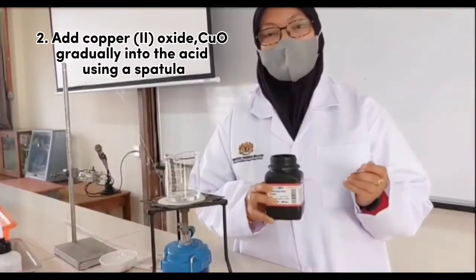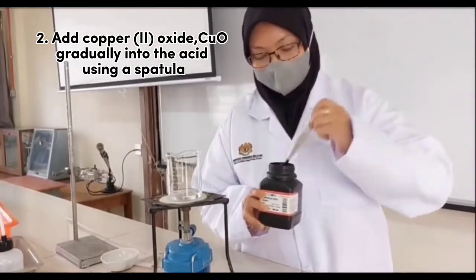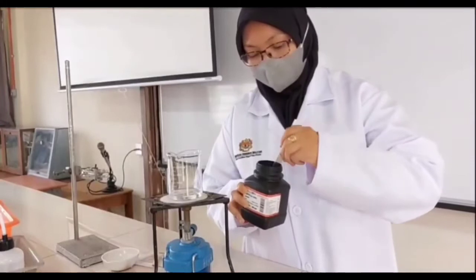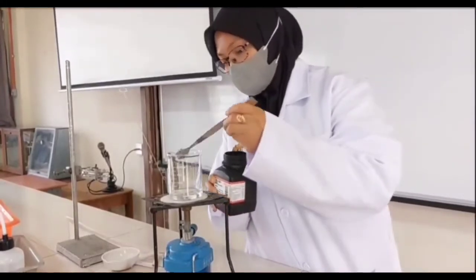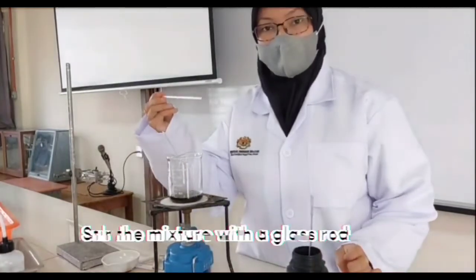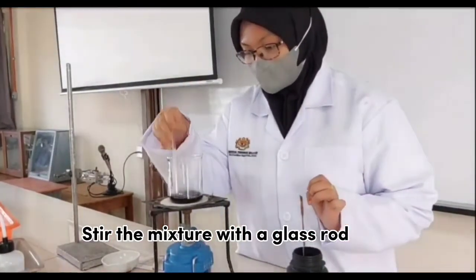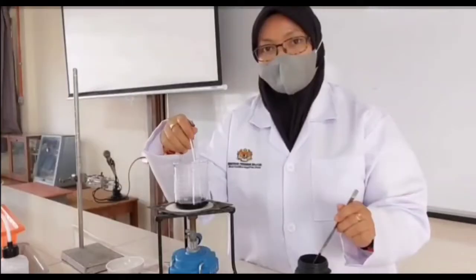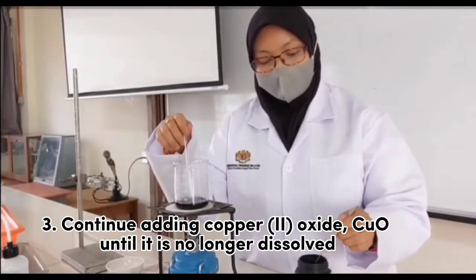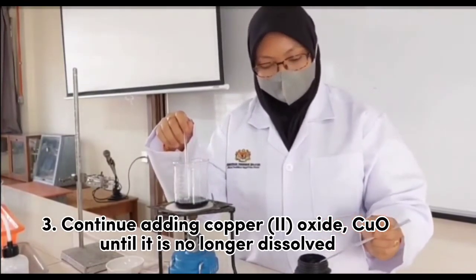Second step, add copper 2 oxide powder gradually into the acid using a spatula. Stir the mixture with a glass rod. Step 3. Continue adding copper 2 oxide until it is no longer dissolved.